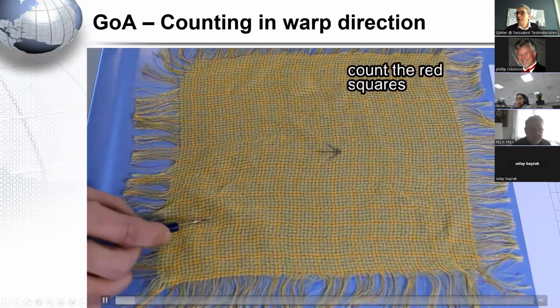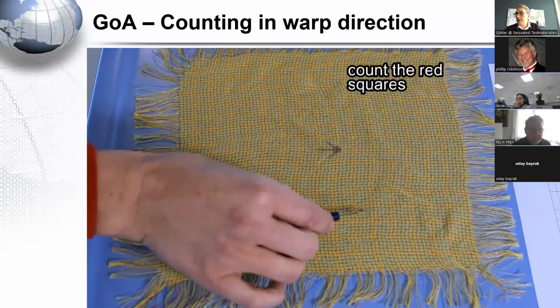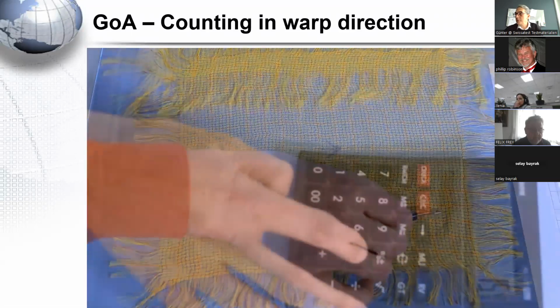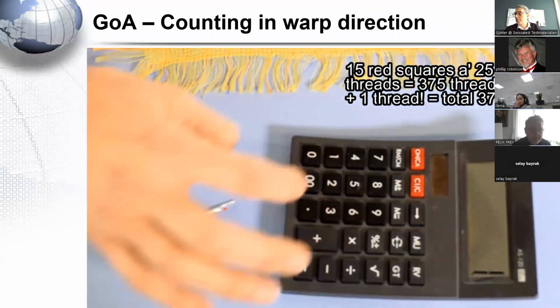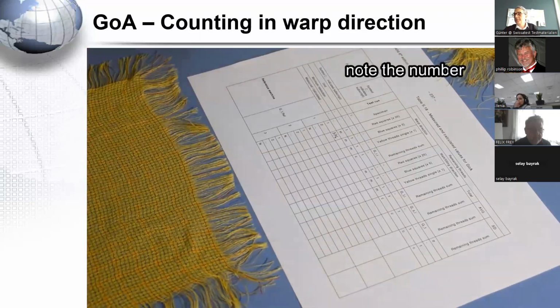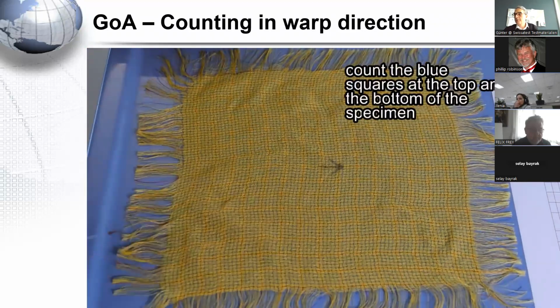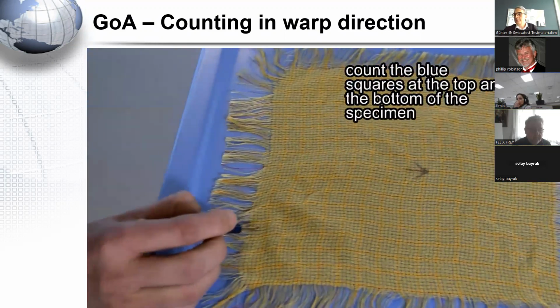Again, a video how to count. See, you can count the single red squares, mean 15 red squares for 25 plus 1, 376. Note the number. Count the blue squares on the top and the bottom of the specimen.